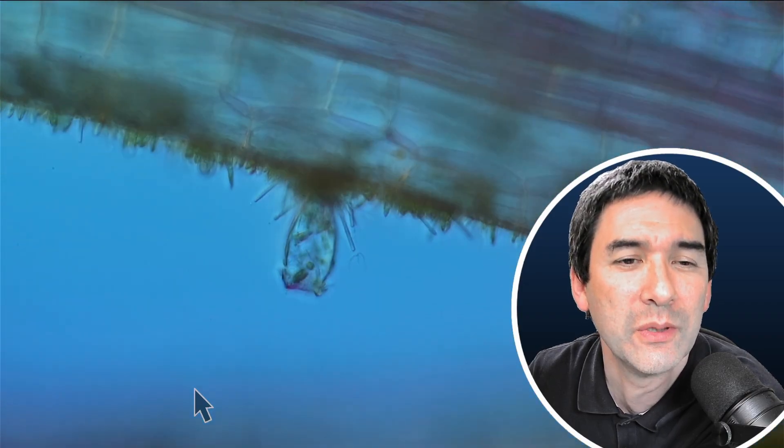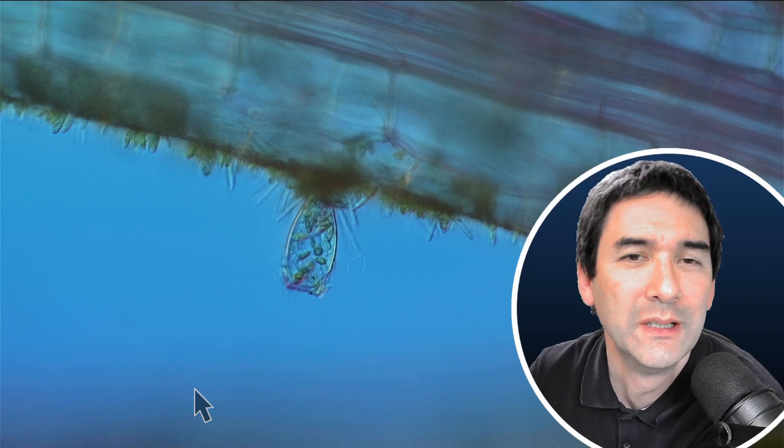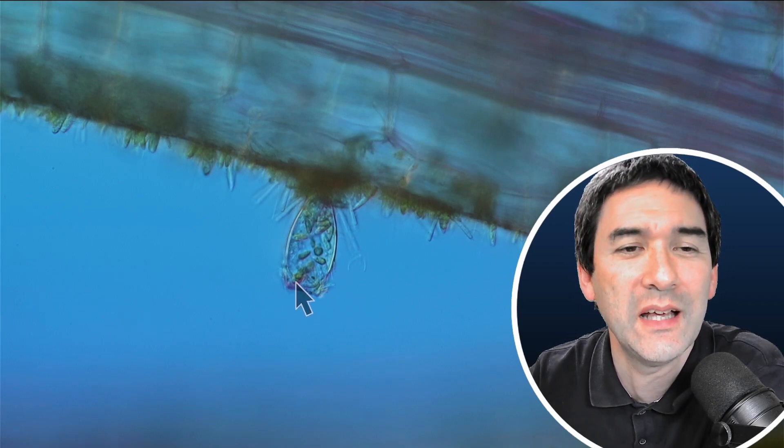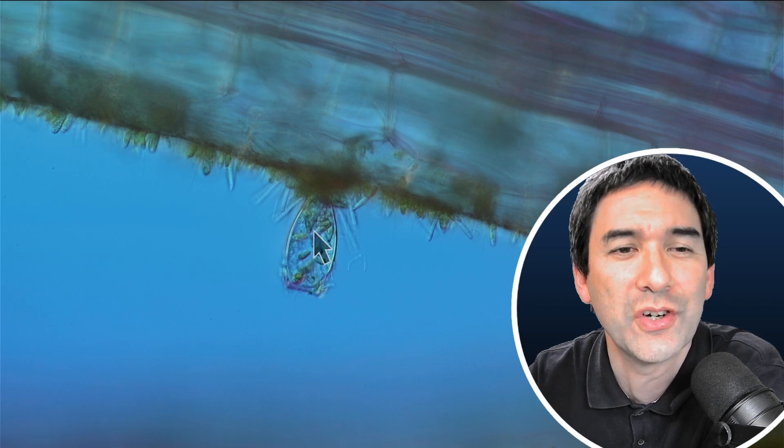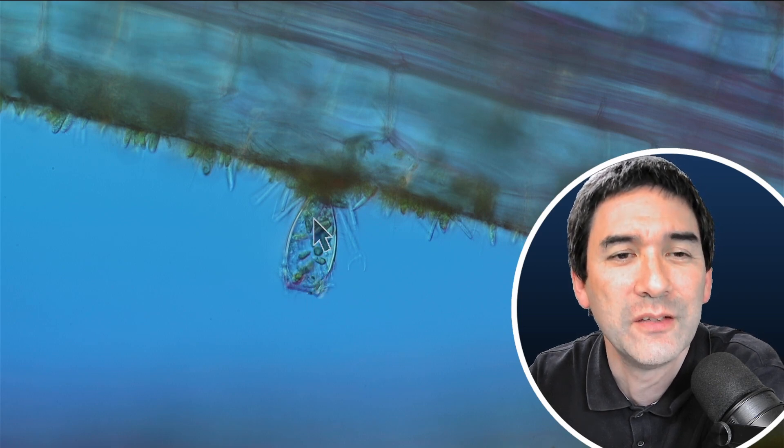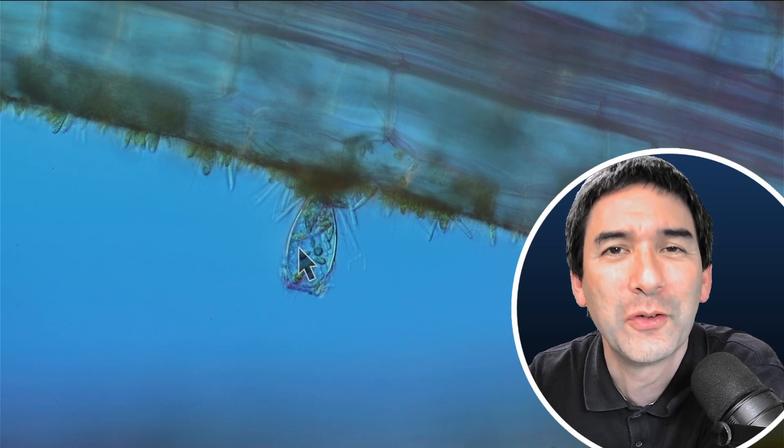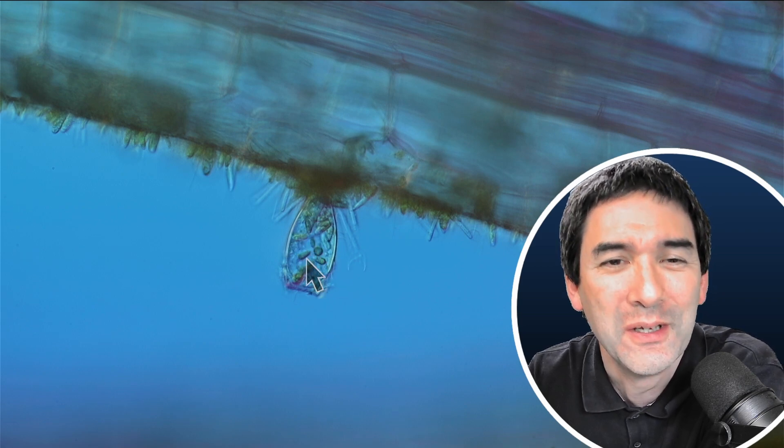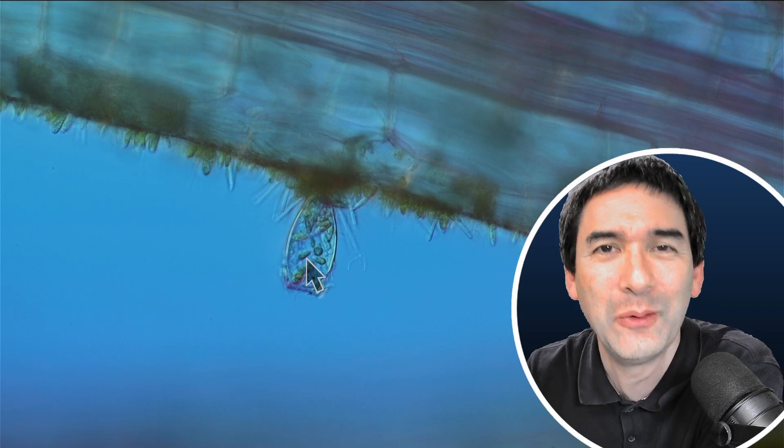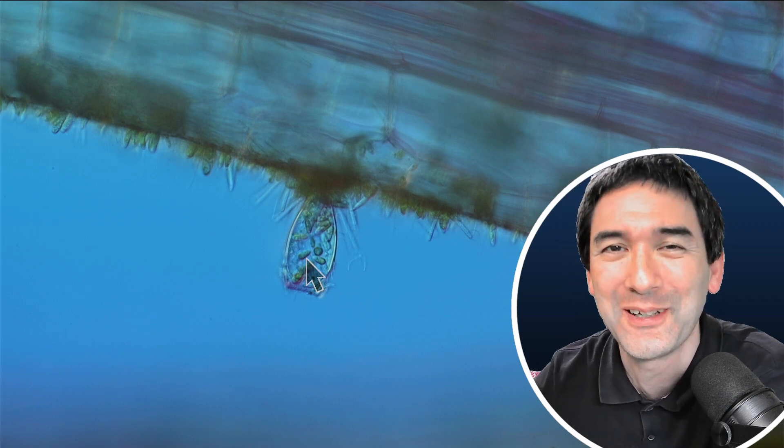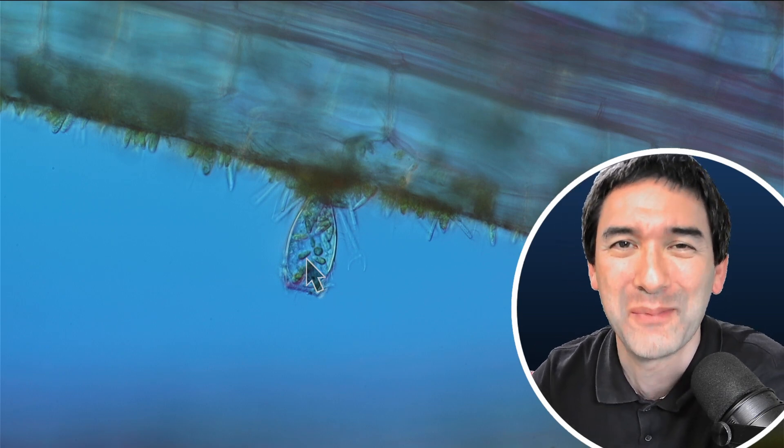Here we have what appears to be a dead rotifer, and you can see those green structures inside—that's the food it has eaten. For whatever reason it stopped living. But at least we're able to observe better what's inside this organism. Just wanted to share this observation with you. Wish you all the best, happy micro-hunting as always. See you around next time, bye-bye.